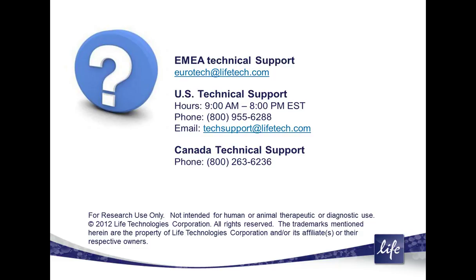There's a question, can F2N 12S be fixed? Unfortunately, that answer is no, it cannot be fixed. I have a question about why we do not have the same percentage of dead cells with 7-AAD and the live dead kit. I'm not sure which example that was referring to specifically, but they should be very close.